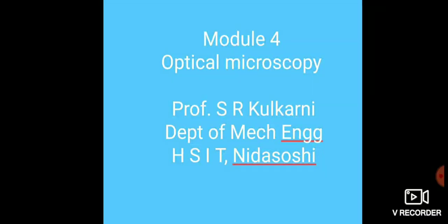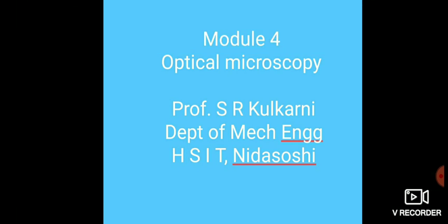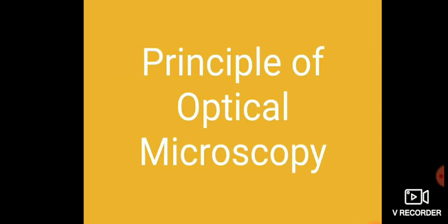Now, in the characterization techniques, we have to study optical microscopy. Now, the principle of optical microscopy.